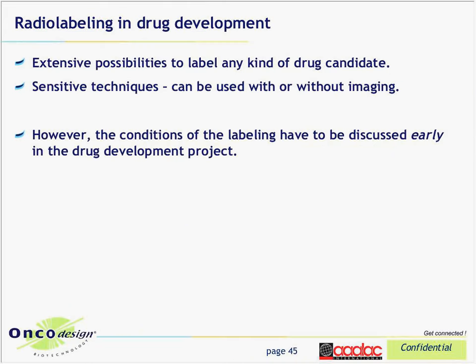As a conclusion, we have many possibilities to label any kind of drug molecule candidate. Radiolabeling is a sensitive technique that can be used without imaging according to your needs. However, the conditions for labeling have to be discussed early in the drug development to choose the most appropriate strategy.